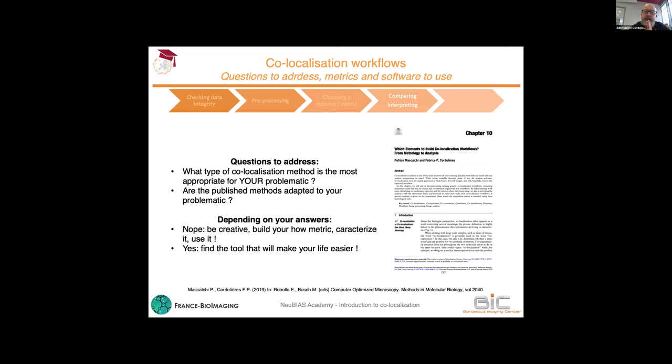Yes, but just because you find Pearson coefficient and Mander's coefficient in all confocal software and in all image processing software that are linked to a microscope, and in all the publications, that does not mean these are the methods that you should use. Maybe a different metric will be more adapted to your specific problematic. So depending on the insights that you will give, if the answer is no, you've got to be creative to build your own metric, to characterize it, to use it and publish it.